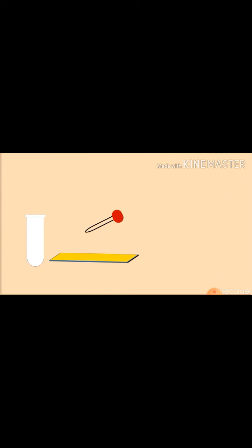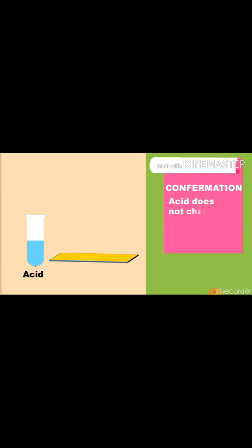Let's see the effect of acid on turmeric paper. Pour few drops of acid on turmeric paper. Here, there is no color change. Acid does not change the color of turmeric paper.